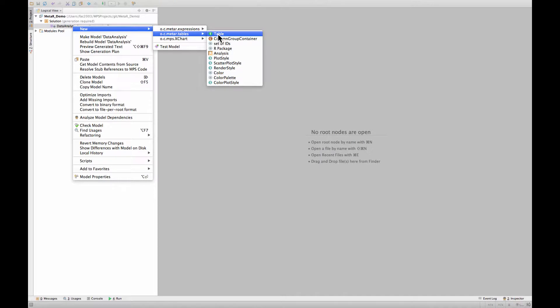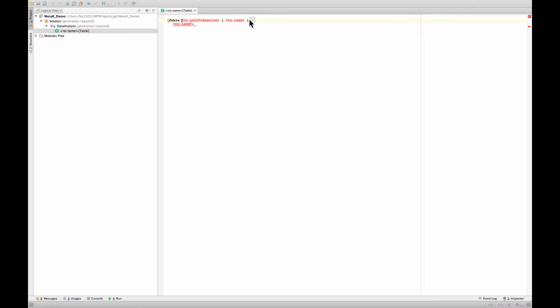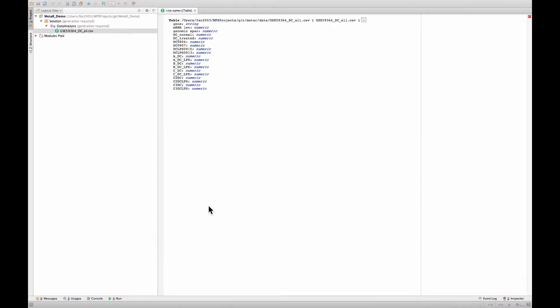So the first thing we'll do is create a new table. We create the table, you see that there are a few attributes that are red: no path to resolve, no name, and no name here. You can browse to a file, and once you do that, MetaR will inspect the file and determine the set of columns in this file.